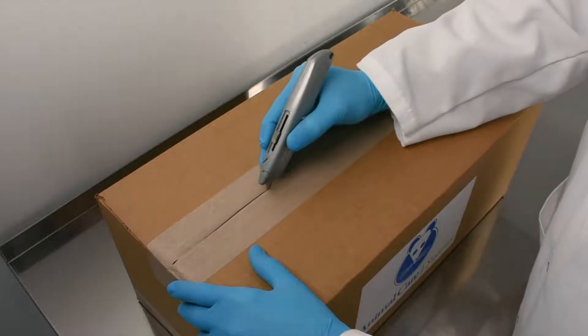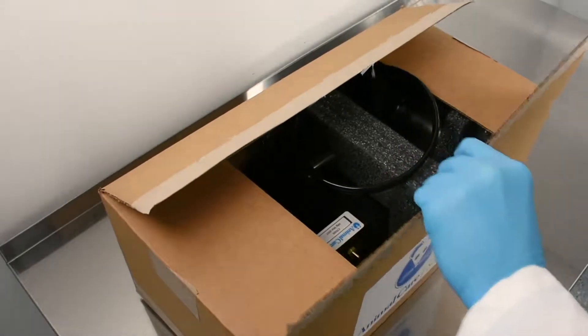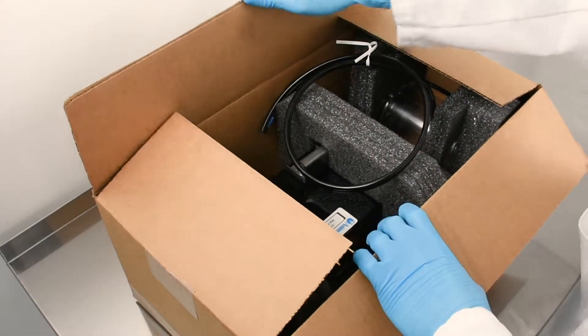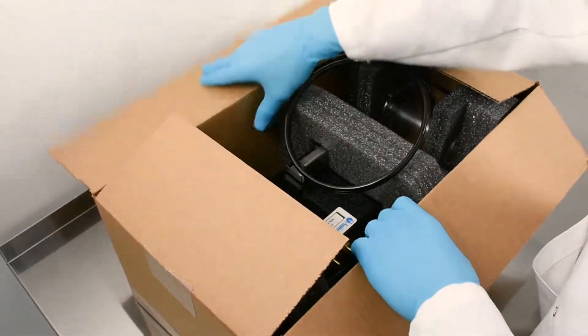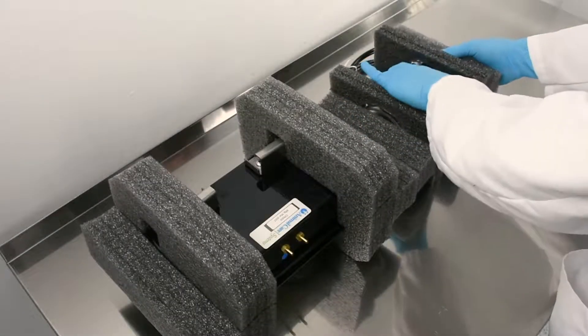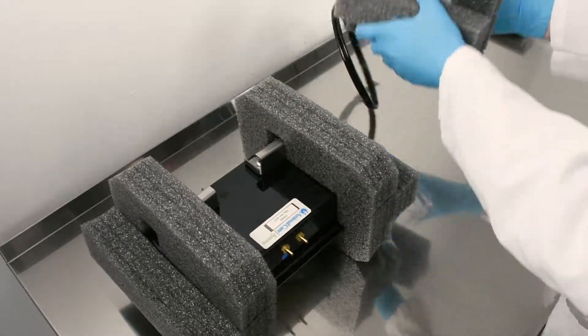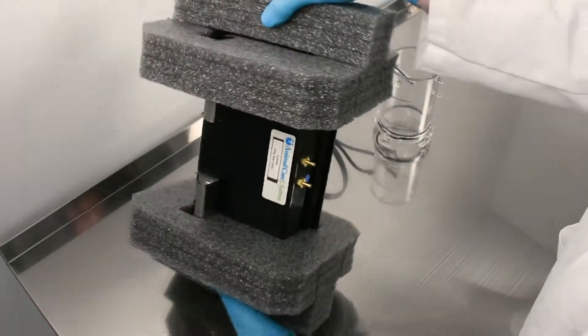When opening the box, do not cut too deeply or the hose may get damaged. Remove the foam padding from the sensor tube and rack status monitor housing.